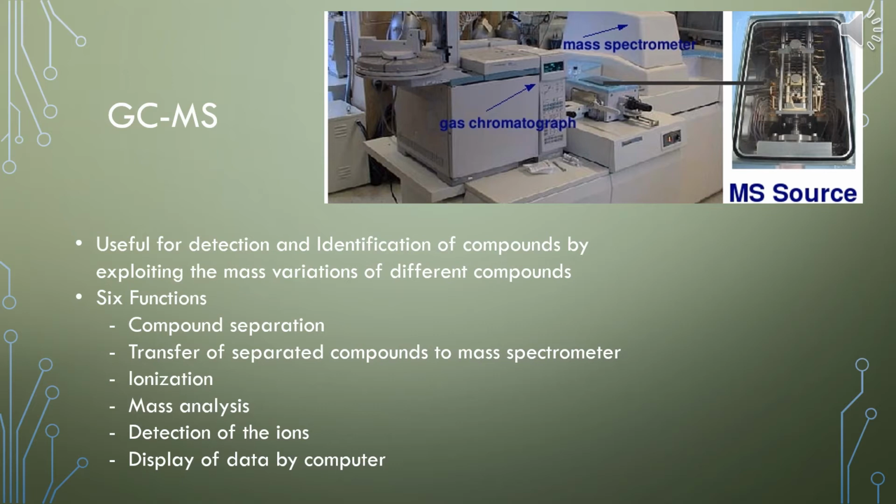The third phase of GCMS involves ionization of the molecule with the mass spectrometer. The molecule from the GC is hit with electrons, causing it to fragment into molecular ions. These fragments are then accelerated through the detector and the mass analyzer by a differential voltage. The ions are now ready to be concentrated into a beam so that only positive ions hit the detector. A typical GCMS run lasts about 90 minutes, in which the mass spectrometer scans the mass range of interest every 3 seconds.